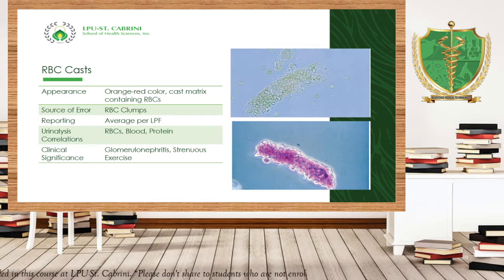The clinical significance of this is glomerulonephritis and strenuous exercise. Definitely, strenuous exercise is an example of a non-pathologic condition, but glomerulonephritis is definitely a pathological condition.